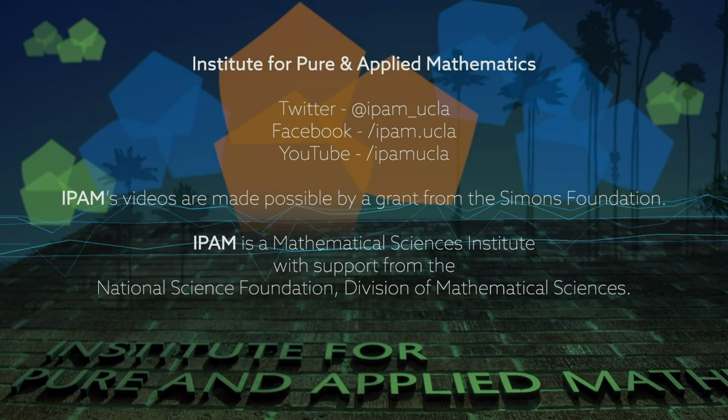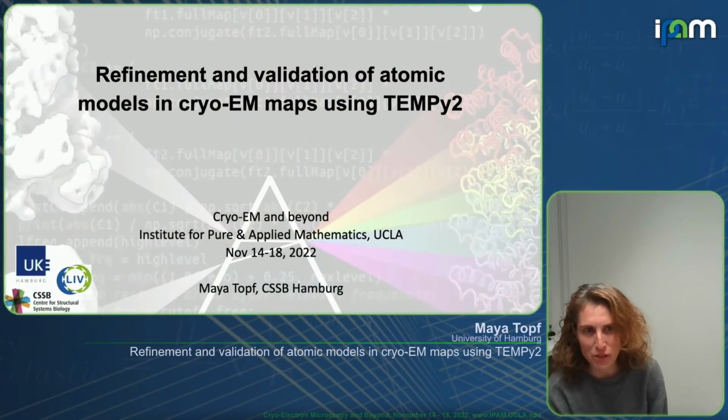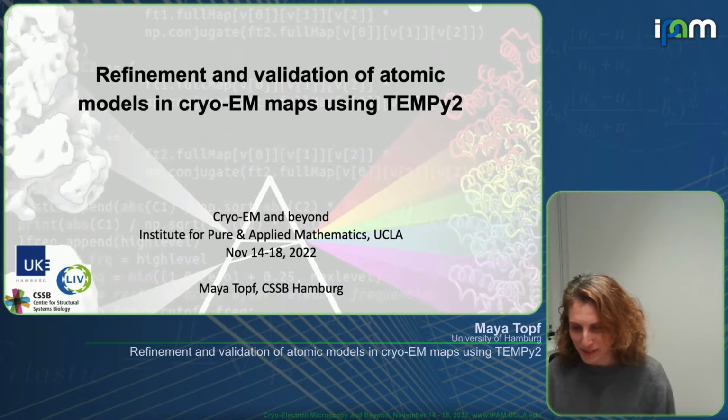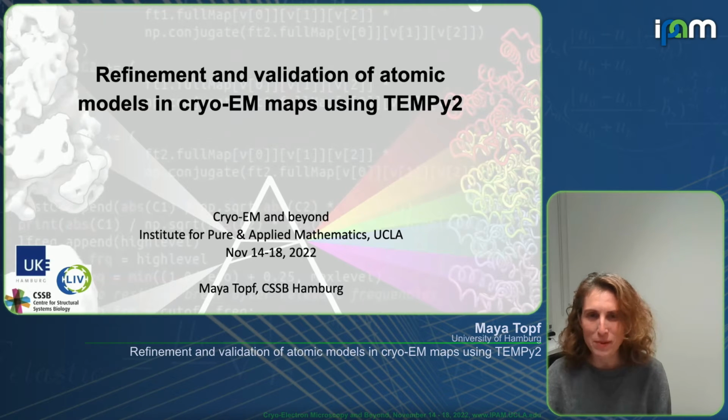So what I'm going to talk about today is the refinement and validation of atomic models in cryo-EM maps using our software TEMPy2. And since I'm in the last day of the conference, you probably heard quite a lot about the status and the state of cryo-EM these days.